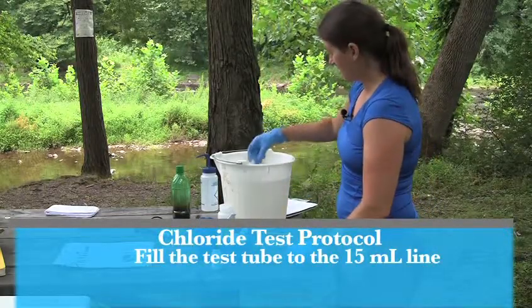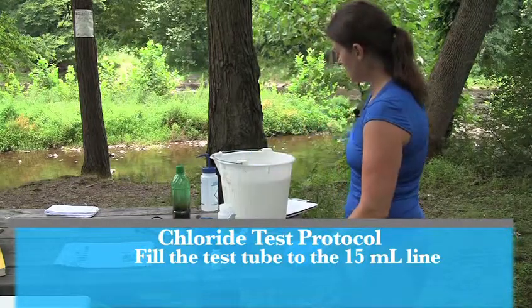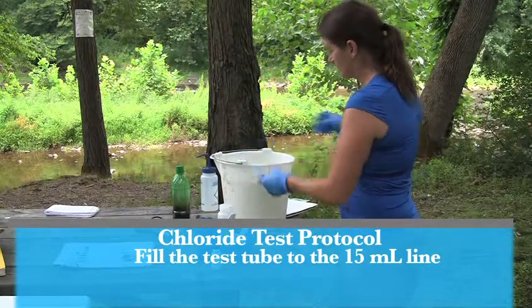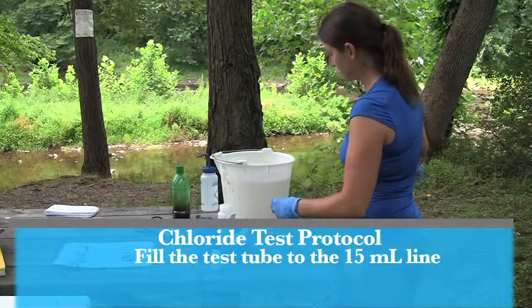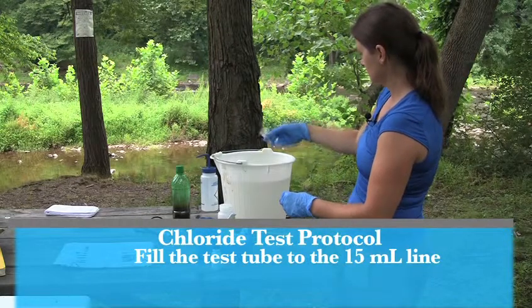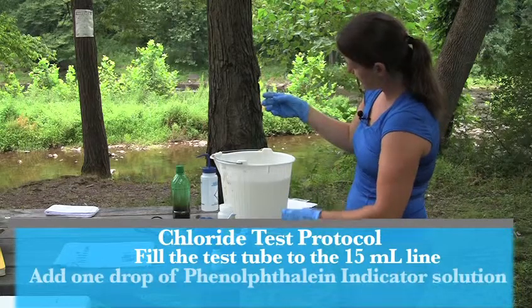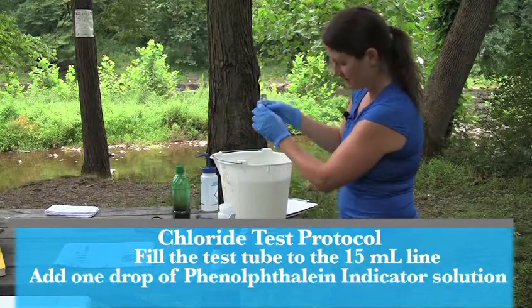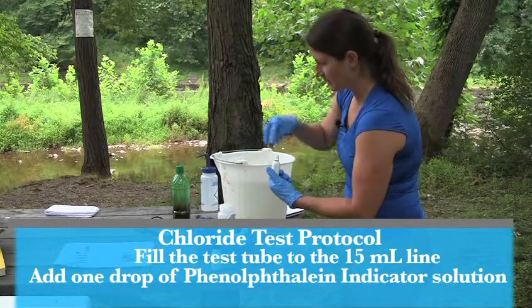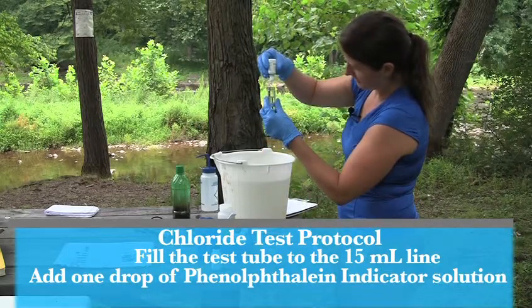You're going to take your vial and the chloride test kit and fill it to the 15 mL line, first rinsing it out three times to ensure you just have the sample water itself. Be sure to rinse the cap as well. Dump out the sample to the 15 mL line, making sure the meniscus is at the white line, and add one drop of the phenolphthalein solution, holding the bottle vertical.